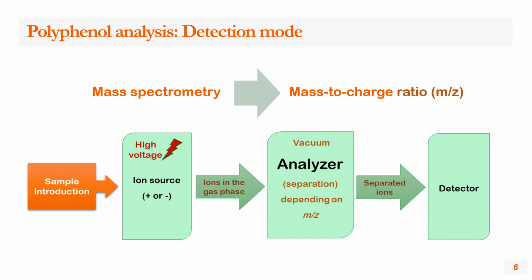After being ionized, they go inside the mass spec, which can read the mass to charge ratios. For small molecules, they usually have one charge. So it usually reflects what is called a precursor ion, or parent ion, which means the compound itself, just ionized, will have gained a proton or lost a proton.